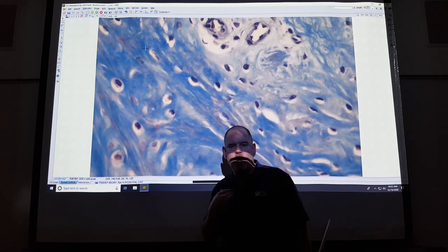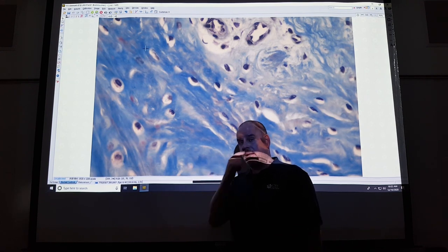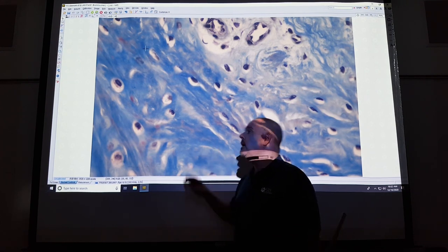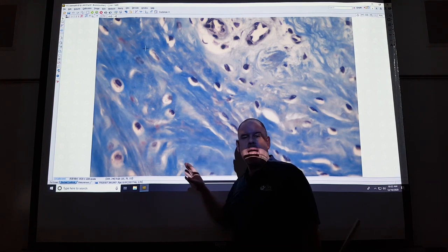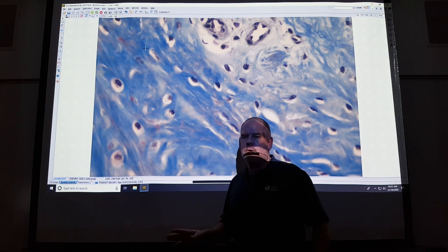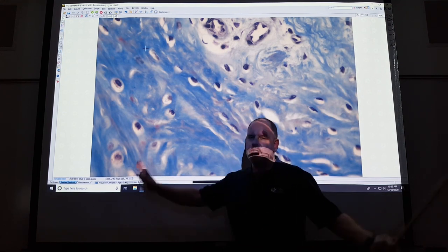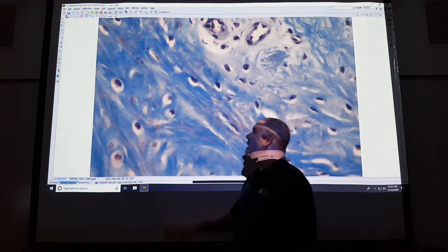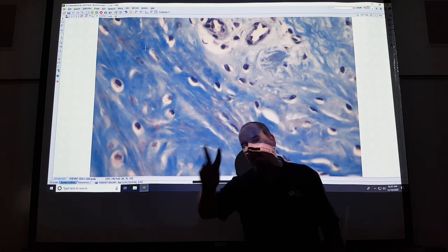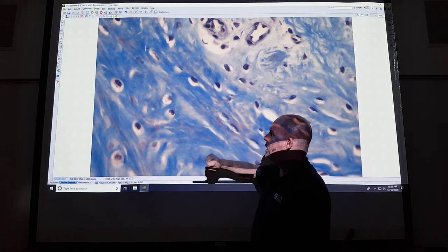If I had my way, I would have elastic cartilage in here and force you to do it. In fact, I even considered just inserting it in the lab anyway, but then I knew that somehow or other, virtually all the other professors would gang up on me, so I resisted the urge. So here we have the only second type of cartilage I get to ask you about in lab, fibrocartilage.